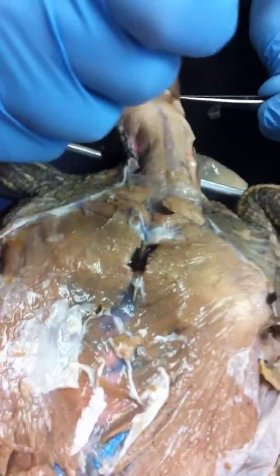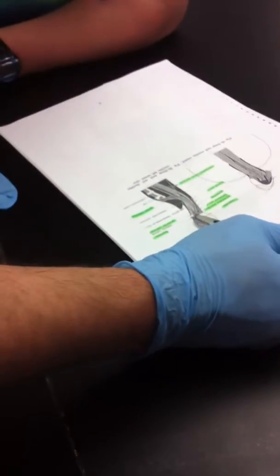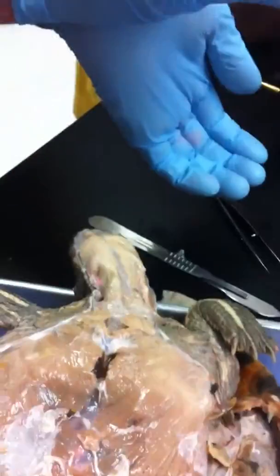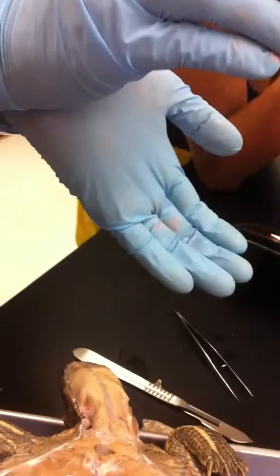There's your depressor mandibulae right there. It curves around the bottom of the jaw — you see it curving around? When that contracts, the bottom jaw opens. It depresses the mandible — it drops the jaw.